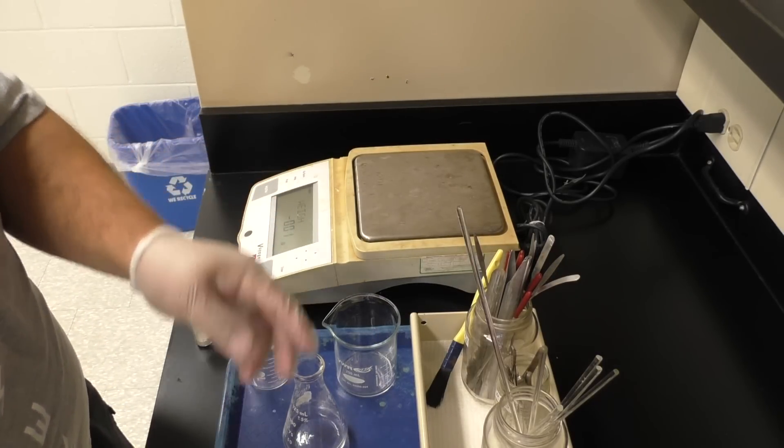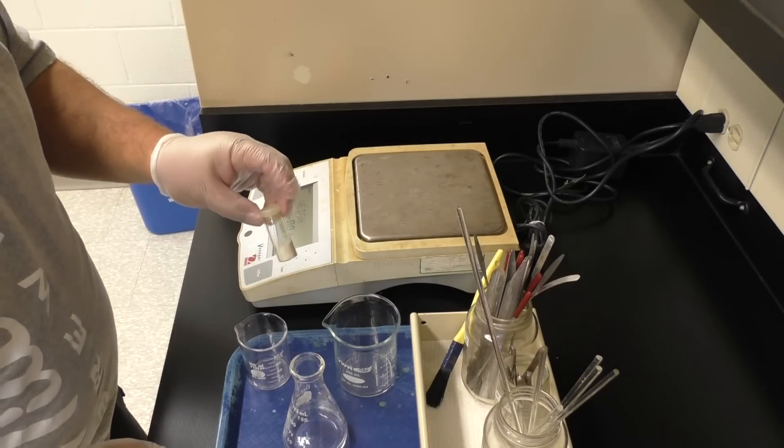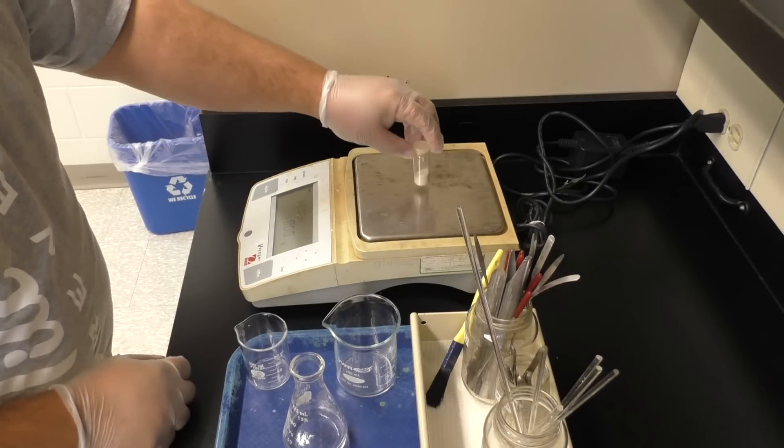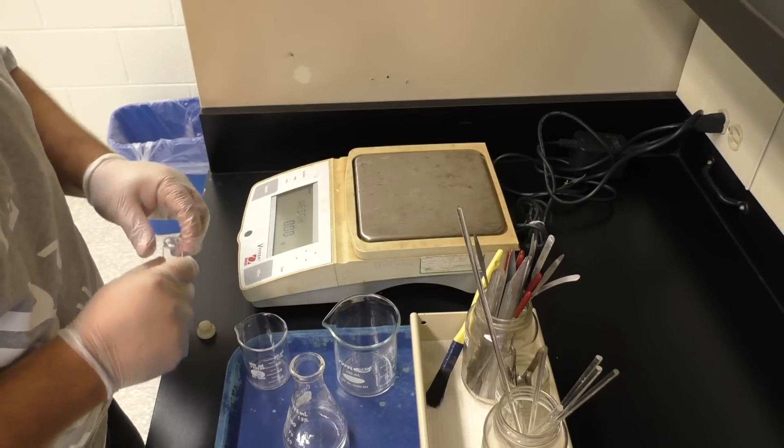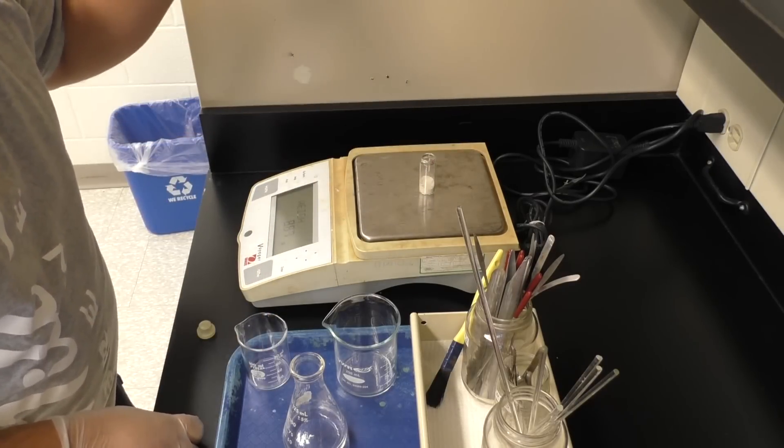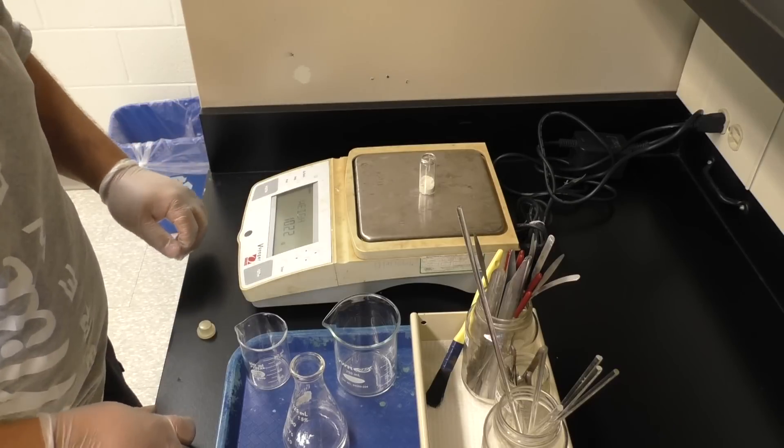And as far as getting your unknown out, so for weighing by difference, you're going to weigh the initial sample, including the vessel that it's in. If you do it without the cap, make sure you're later weighing without the cap.